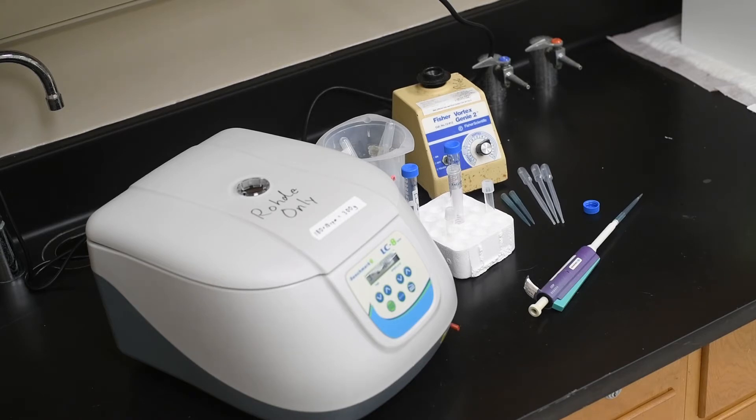Place them in a centrifuge for 5 minutes and spin them into a pellet. Since I had two tubes of equal volume, the centrifuge was balanced.